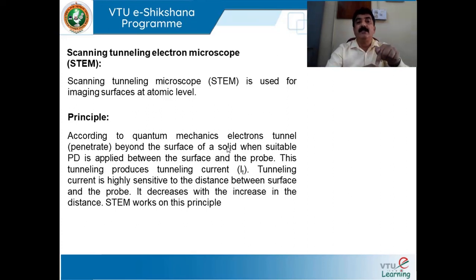As a result, you will gather information not only from one particular point on the surface, but from the entire surface. So thereby, you can study the surface of the specimen. So I repeat, the scanning tunneling electron microscope works on the principle of tunneling of electrons.